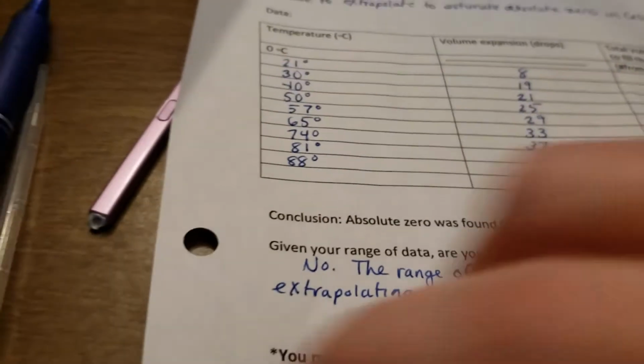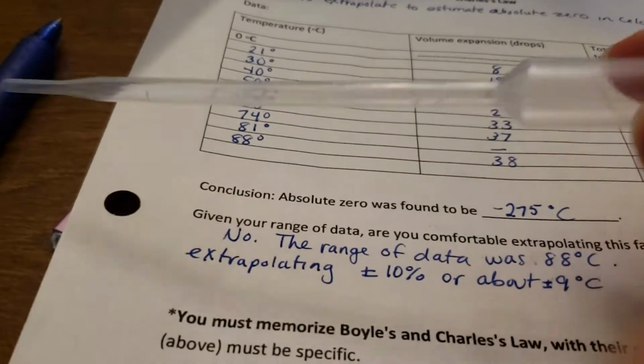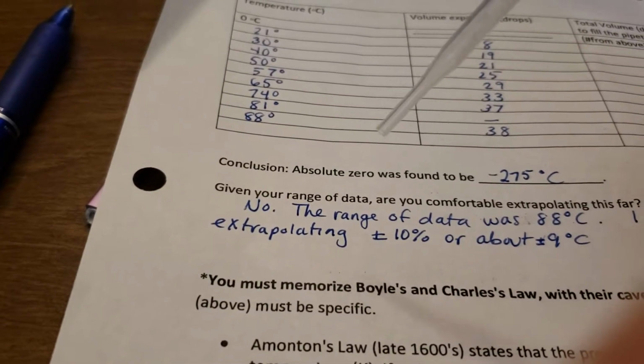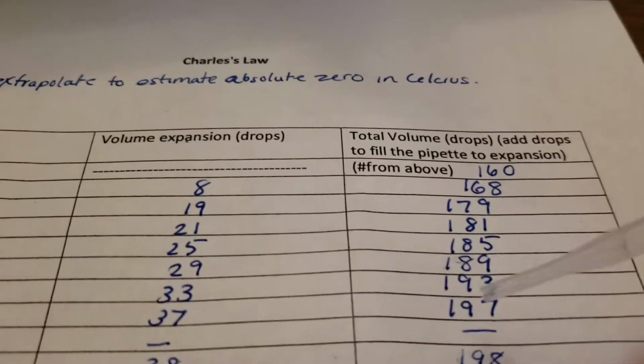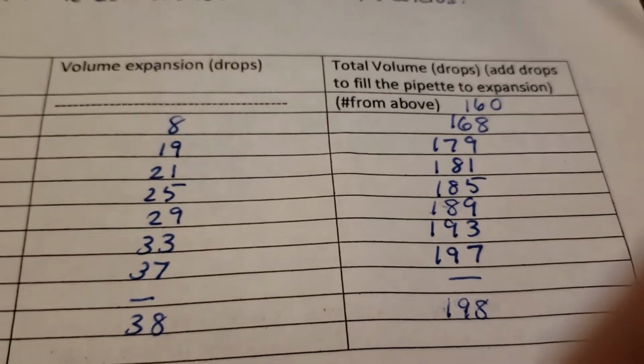You first take one of these micro pipettes that we used for Boyle's Law as well. You fill it all the way full, and you count how many drops it takes to empty it. Drop, drop, drop, drop, how many drops to empty it. In the case of the micro pipette we used to get this data, it took 160 drops to empty the pipette all the way. And you want to do that a couple of times, make sure it's really 160 and you didn't lose count. I did that carefully, and we got 160 drops from one of these pipettes.